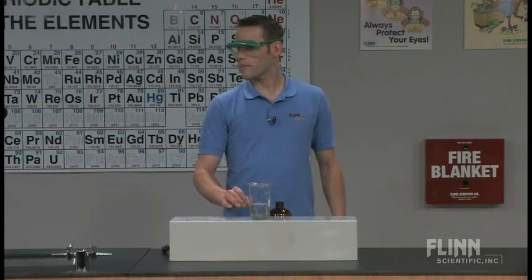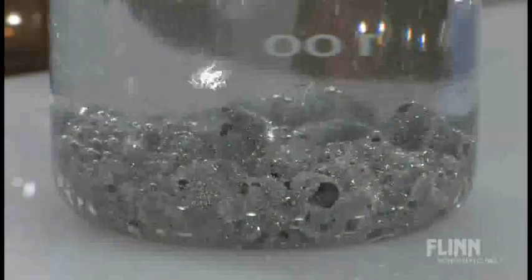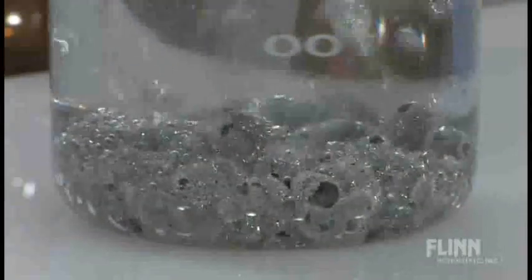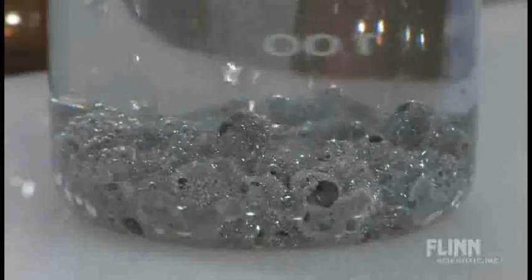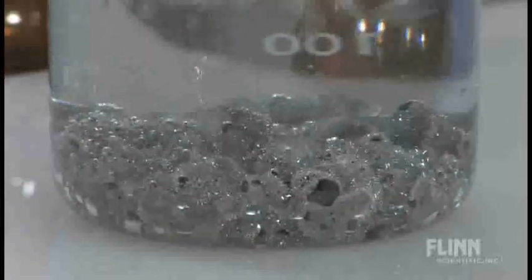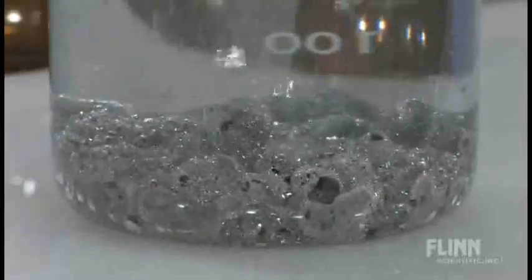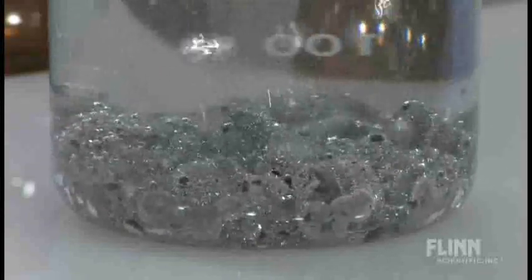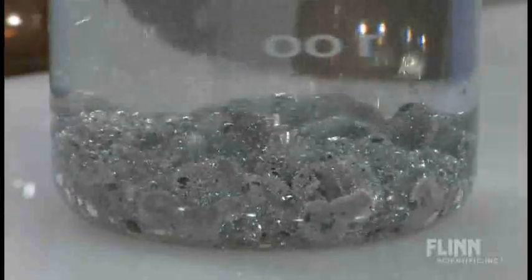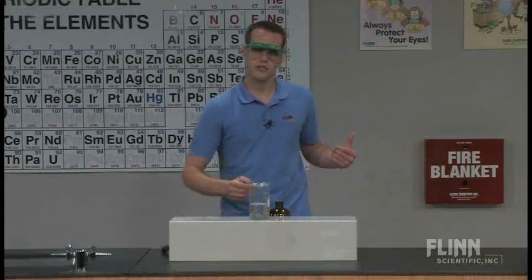The other one you can probably notice, if we can get this on the close-up camera, you can probably already start to see a little bit of fuzz forming on those zinc particles. That fuzz are tin, elemental tin crystals forming on the outside of the zinc. So we have two single replacement reactions here. I'm going to go to the chalkboard and put these reactions on the board.